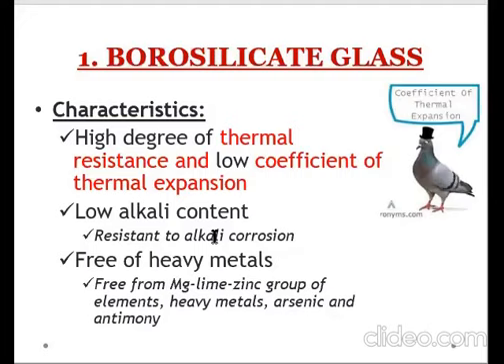So when we say thermal expansion, remember, that is the tendency of matter to change in shape, area, and volume in response to a change in temperature. In other words, when we say low coefficient of thermal expansion, ano po ibig sabihin nito?